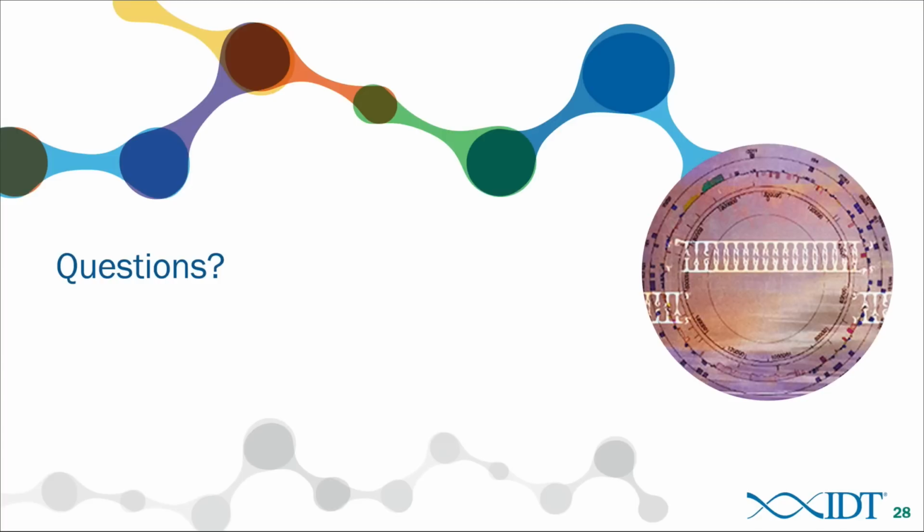Okay. So we have shown some data, a little bit in this webinar, but also in previous webinars, about efficiency of the Alt-R CRISPR system. Is there anything about improved specificity with the Alt-R CRISPR system? Yeah, well, the improved specificity goes to the question of does it reduce off-target effects a little bit? And I mean, yes, we show more potency on target, but we have not investigated those results at off-target sites yet.